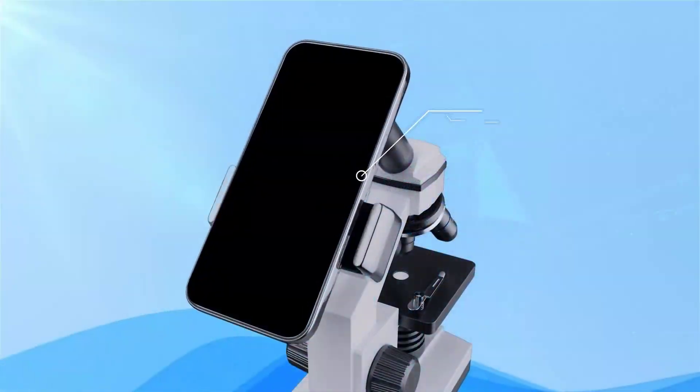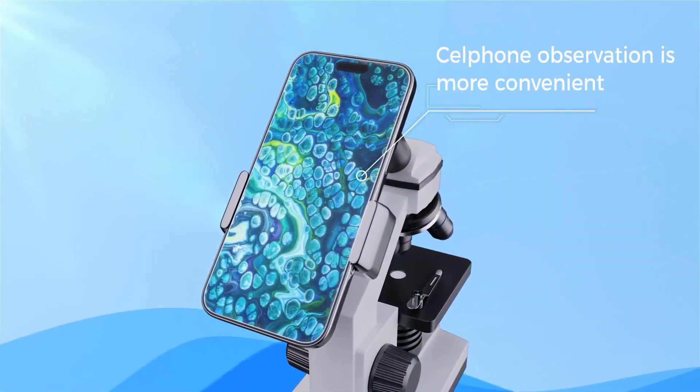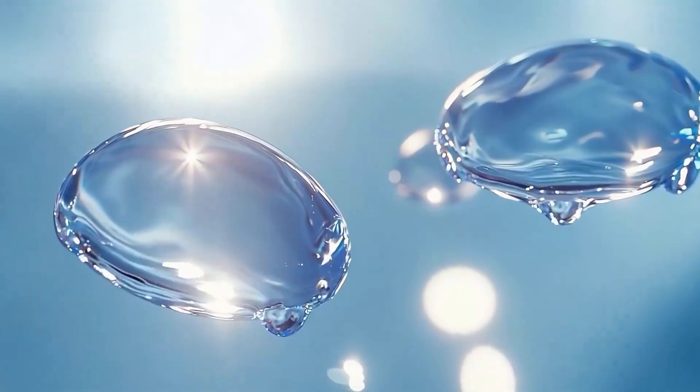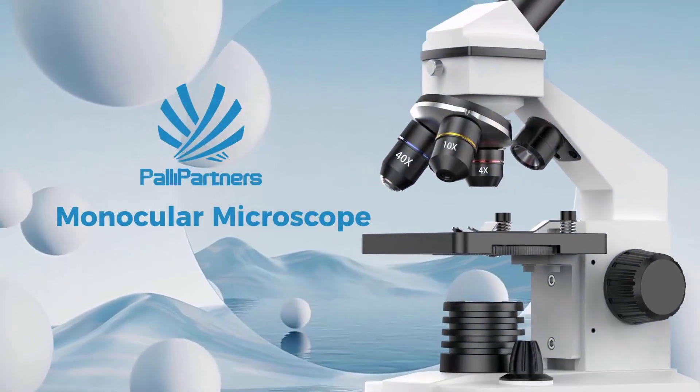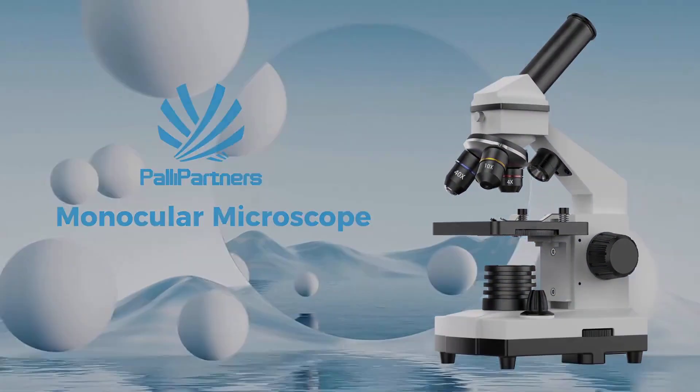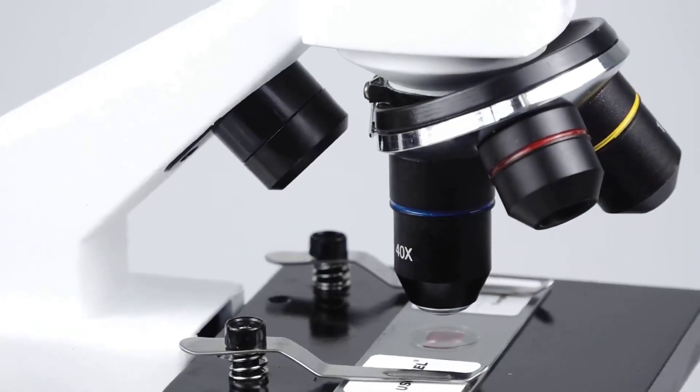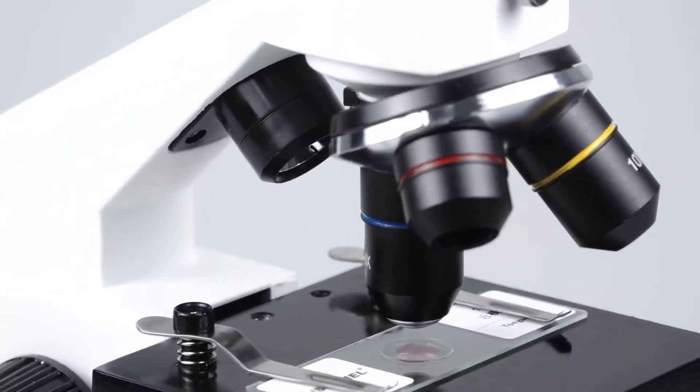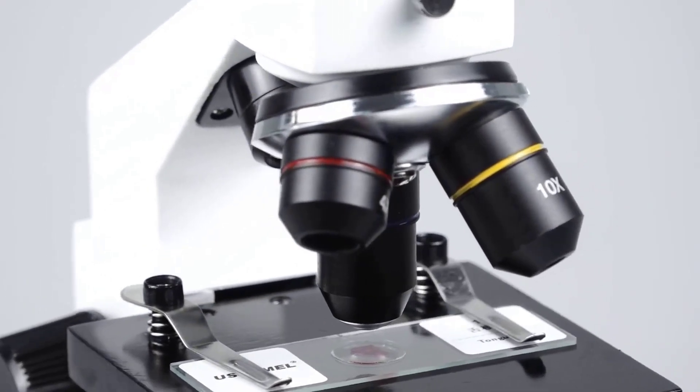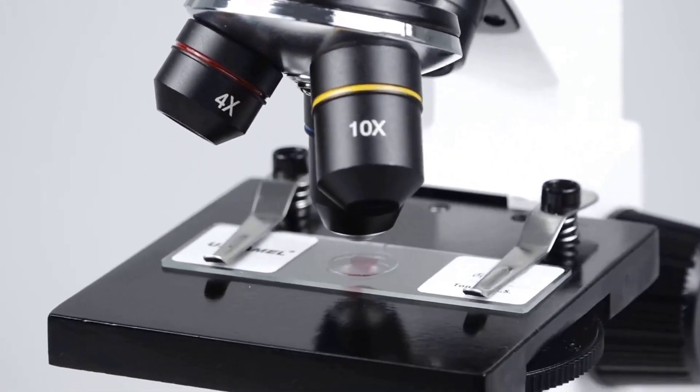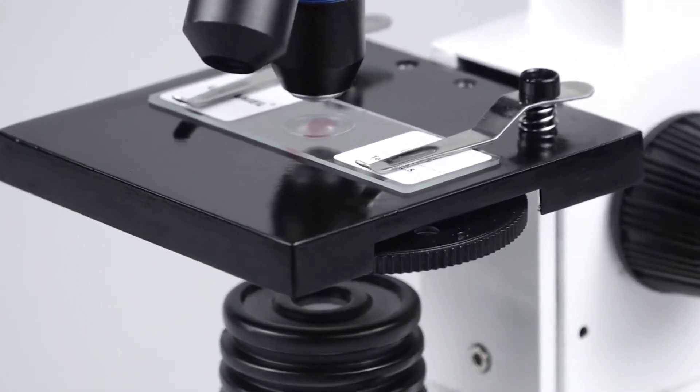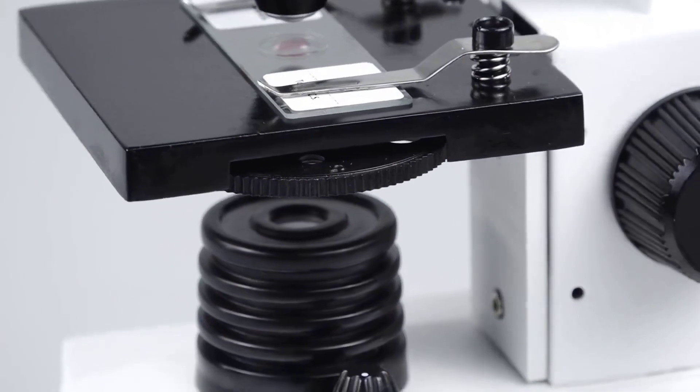A key highlight is the microscope's dual illumination configuration, featuring both overhead and base lighting systems. This thoughtful design ensures optimal visibility when working with translucent samples and various specimen types. The premium metal construction enhances durability and stability during use, distinguishing it from lower quality plastic alternatives. The focusing mechanism, though slightly firmer than some luxury models, delivers the precision needed for detailed observations.